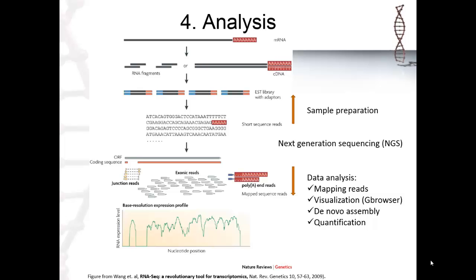Mapping is one of the many ways that the data needs to be analyzed after it's been sequenced. There's also visualization and quantification. All of these are done using bioinformatics tools.